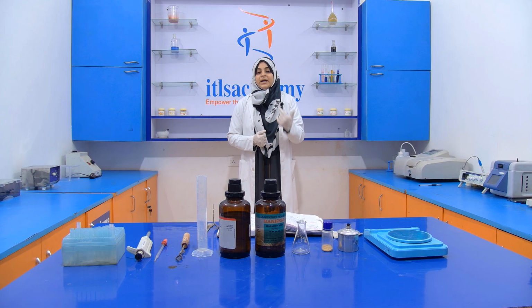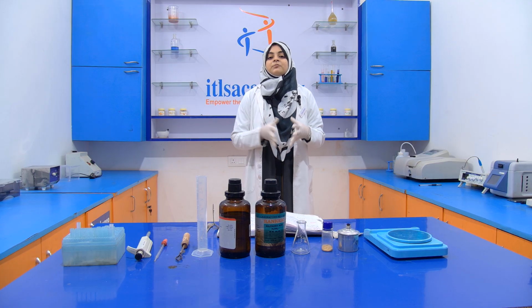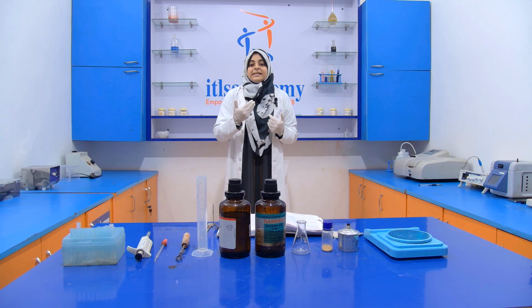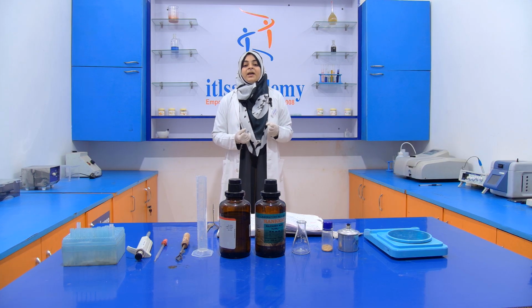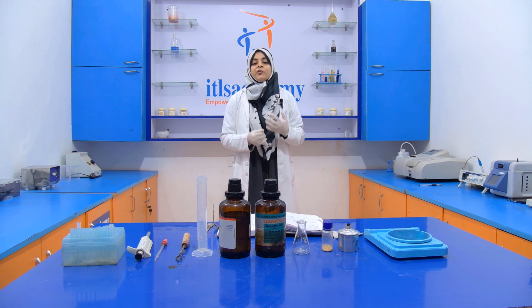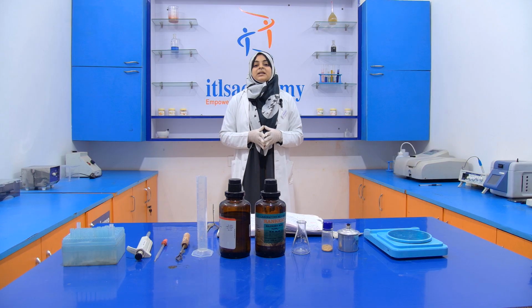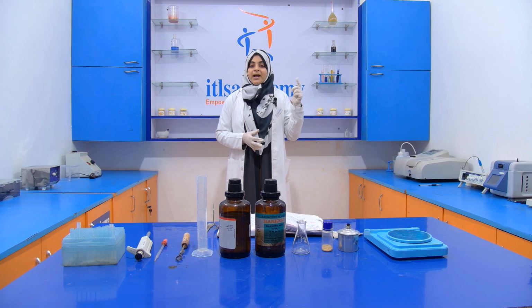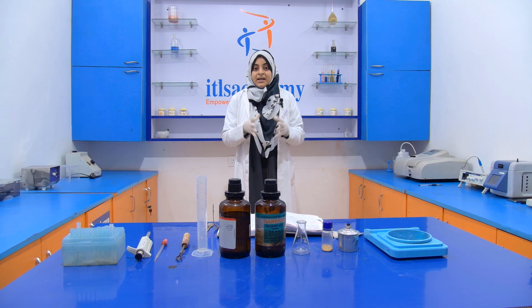Otherwise, if it comes in contact with our skin, it will burn our skin. Even it will damage our skin if it is absorbed by our skin. If it comes in our eyes, then it causes irritation and will damage our eyes. That's why we have to avoid it. Even we have to avoid inhaling the vapor of the concentrated sulfuric acid, otherwise it will damage our respiratory tract. That's why when we are handling it, we have to take extra care.